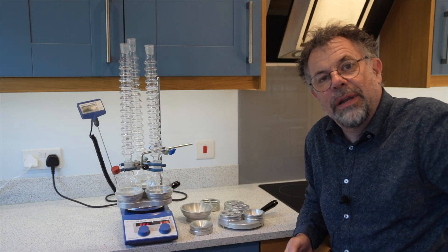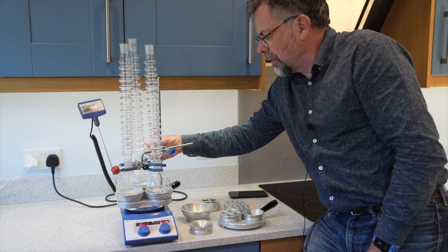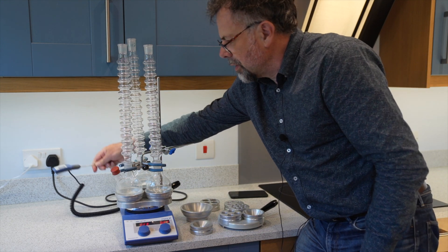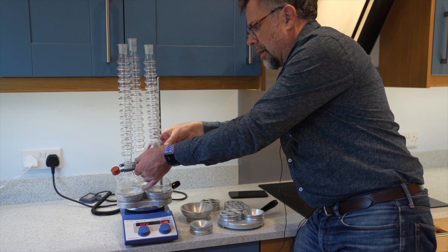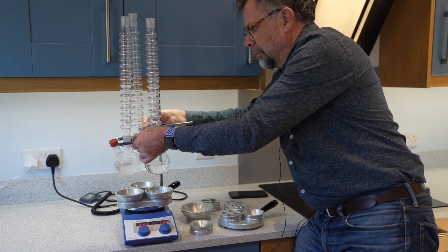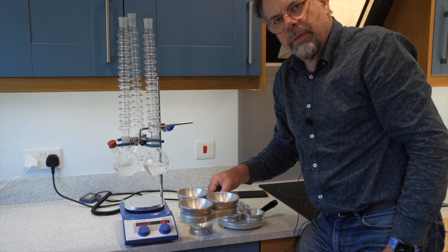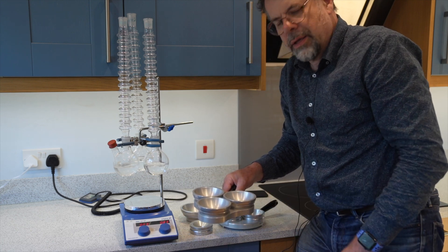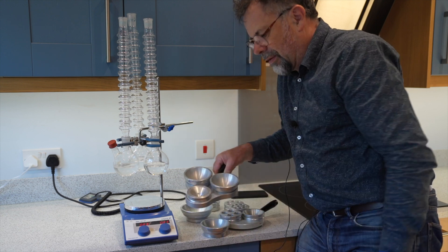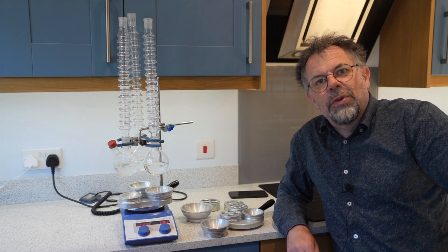Let's turn that off and show you how it disassembles. If we want to remove it from the heat source, I'm going to undo the retort clamp here, take the temperature probe out from the hot plate stirrer, and then lift these up. This enables you to remove the Driesing block from the hot plate very easily and change the inserts — of course if it's not hot — for whatever size you wish.